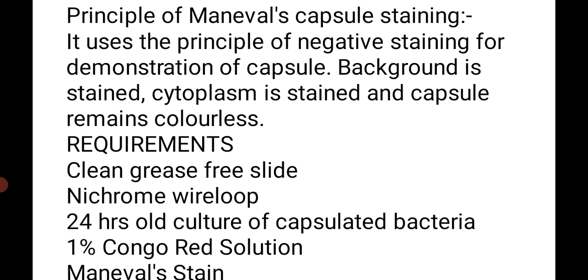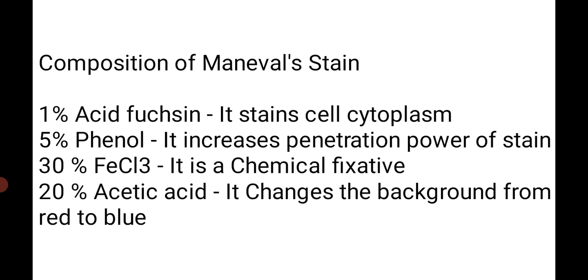The requirements: clean grease-free slides, nichrome wire loop, 24 hours old culture of capsulated bacteria, 1% Congo red solution, and Maneval's stain. These are the requirements for it. The next, the composition of Maneval's stain. It has 4 components: 1% acid fuchsin, 5% phenol, 30% FeCl3, 20% acetic acid.